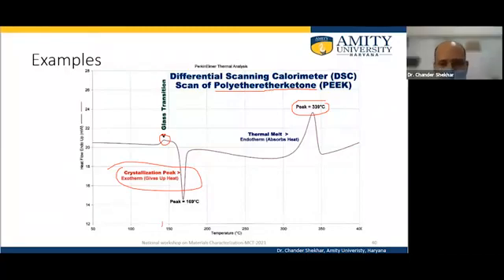Protein molecules. Okay, if there is any energy exchange between the various forms of protein, that can be seen. The instrument doesn't differentiate between samples; any kind of sample which is not volatile in the crucible can be used, and definitely we can see these peaks.